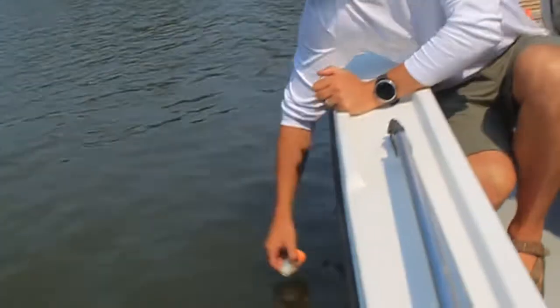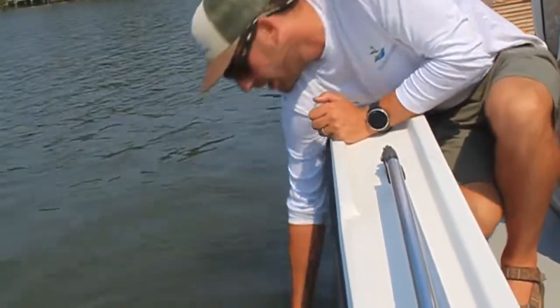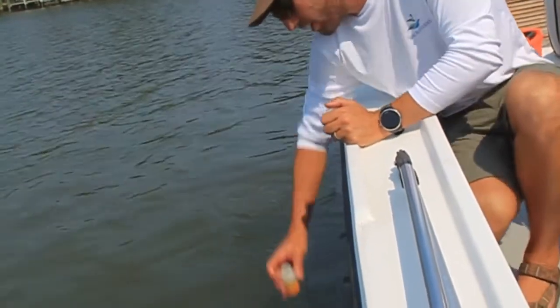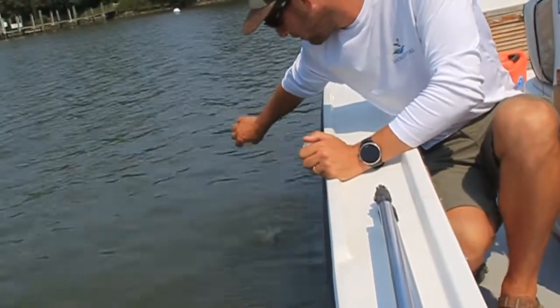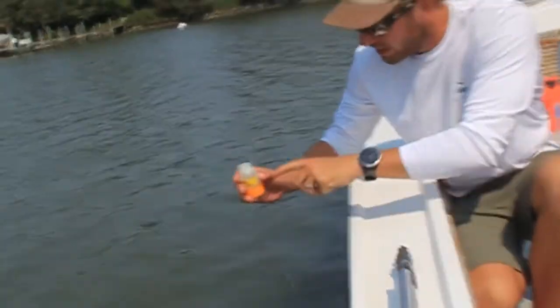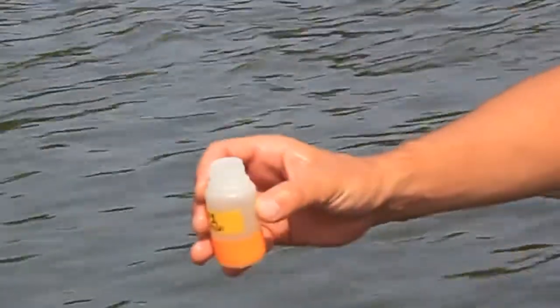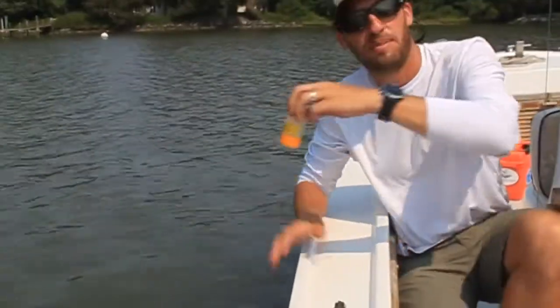The method here is you want to rinse the bottle at least 3 times, and the way to do that is fill it up and then deposit that water in another area so you're not picking up that same water in your sample. And then on your 4th one you can go ahead and fill it all the way up here, and then we need just to leave a little room because these samples will get frozen. We want to have some room for them to expand, so we'll go just below that little area there, and then seal it up and then put it on ice immediately.